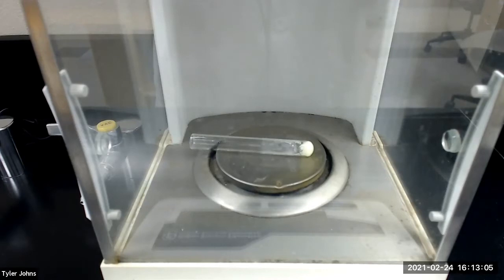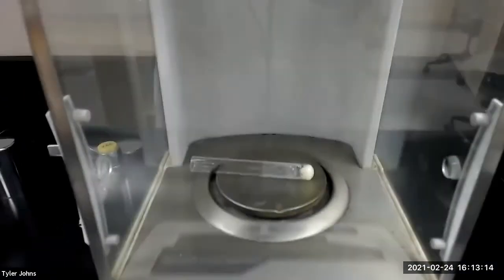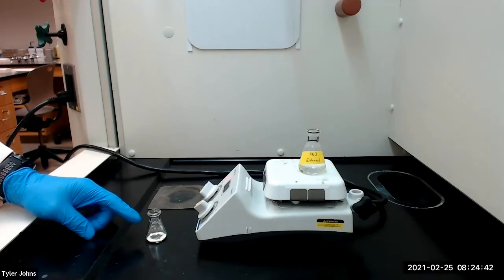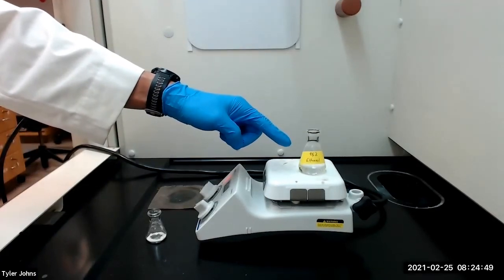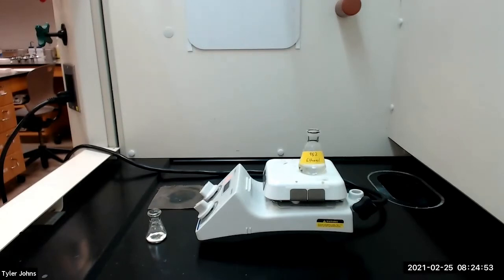The mass of the pre-weighed test tube plus the partially purified product is 8.3274 grams. I've transferred the partially purified product from the test tube to a 10 milliliter Erlenmeyer flask, and we will now perform a recrystallization of the product using a minimum amount of boiling hot 95% ethanol. After the solid has dissolved, we will allow the flask to cool to room temperature and induce crystallization by scratching the inside of the flask.